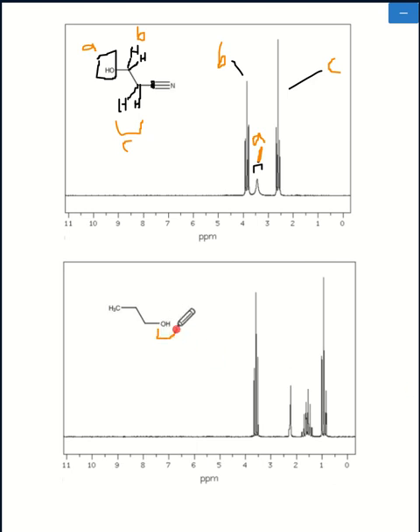I guess I can say that this guy right here, that alcohol, would show up as this peak right here, because it's a little more broad toward the base as opposed to being nice straight lines. So you can show the hydrogen that are coming off of this carbon, and then the remaining carbon has 3 hydrogen. You can use the n+1 rule to do your best to figure out which of those peaks belong to which hydrogen, and things like that.